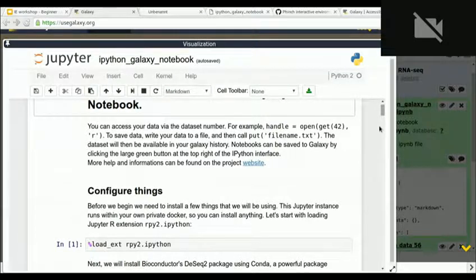Yeah. Still, there are some people that say Docker is not safe, and it is up for discussion. What we are doing, and what Galaxy is also doing, is we have a prepared cluster and our own VM, the real VM, which is running the Docker container inside. So even if the user breaks out of the Docker container into the host system, it's still in the VM where they can't access anything. So you can build these layers and the infrastructure can be secured in this way, so that you can run these complicated setups.